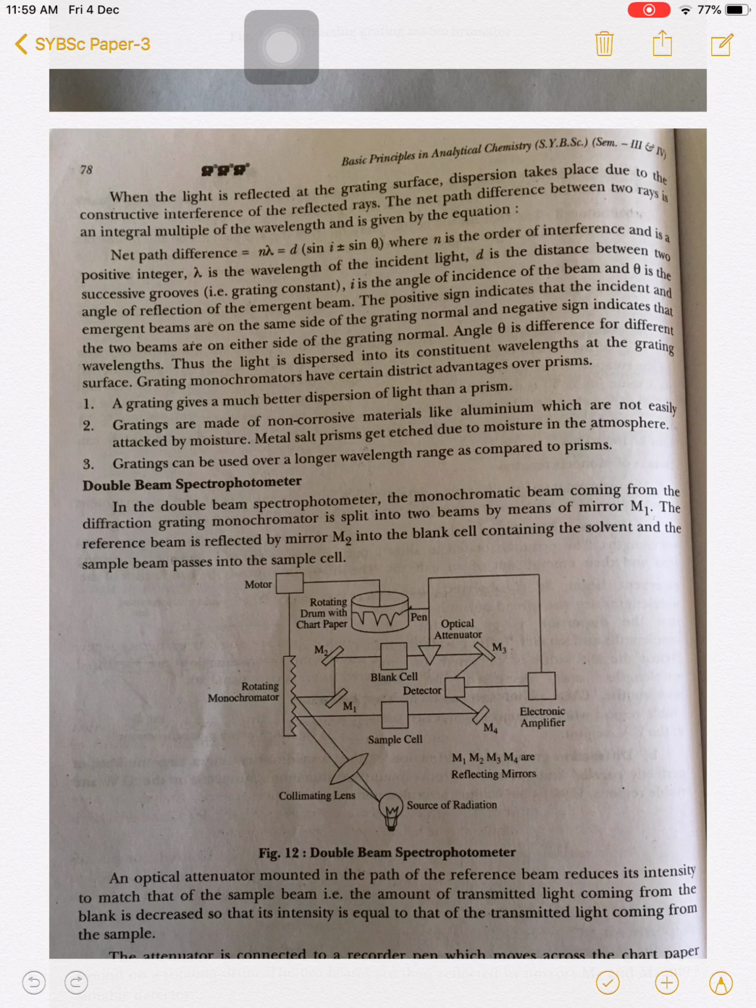The angle theta is different for different wavelengths. Thus the light is dispersed into its constituent wavelengths at the grating surface, and grating monochromators have certain distinct advantages over the prism. So what are the advantages over the prism?